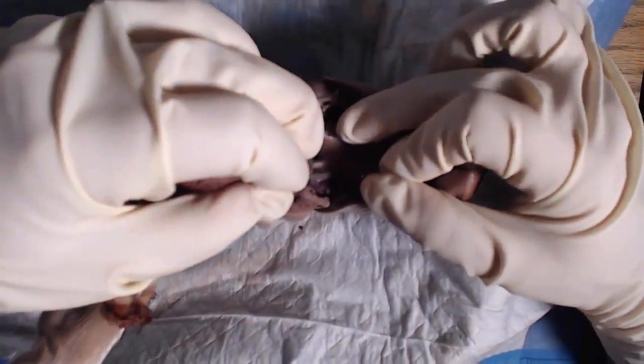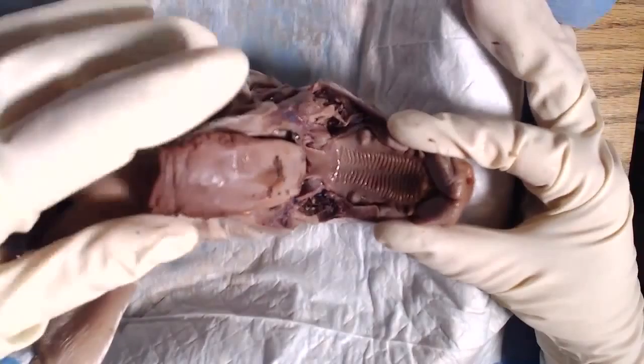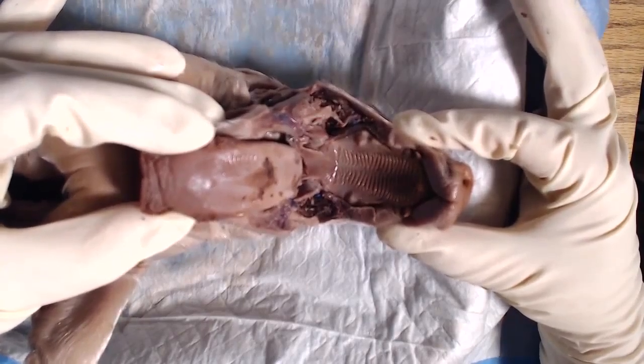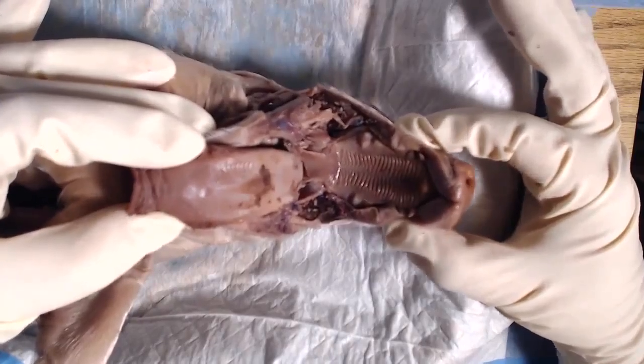Again, you're going to have to put some muscle into it. We're just going to be pulling it apart like this. So this is the view you should have. And those cuts we made earlier should make that easier. So you should have a nice open view of the mouth. You can see a lot of the structures.